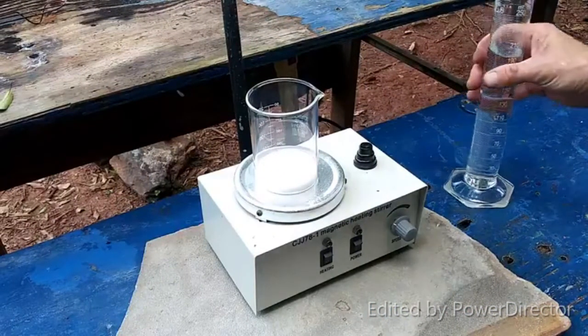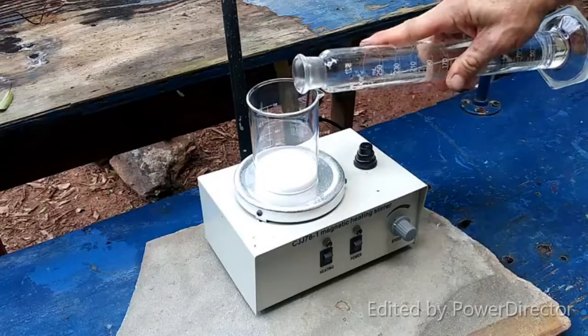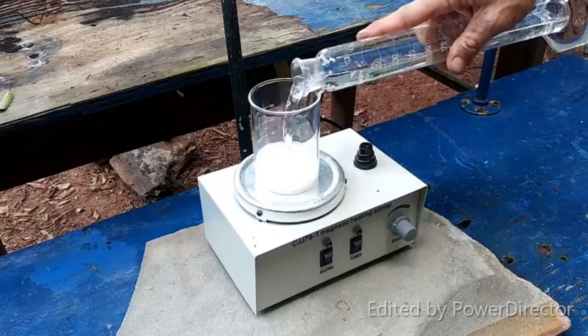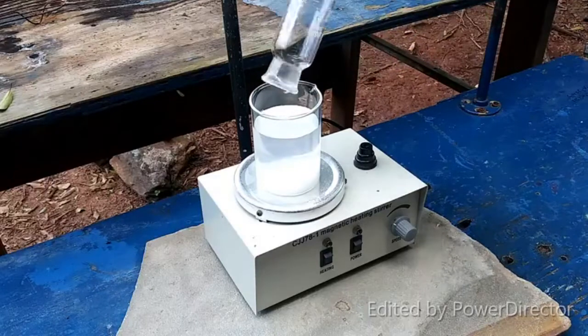The first step is to dissolve 50 grams of lead acetate in 200 ml of water and 5 ml of glacial acetic acid. I'm just going to combine that all in here.